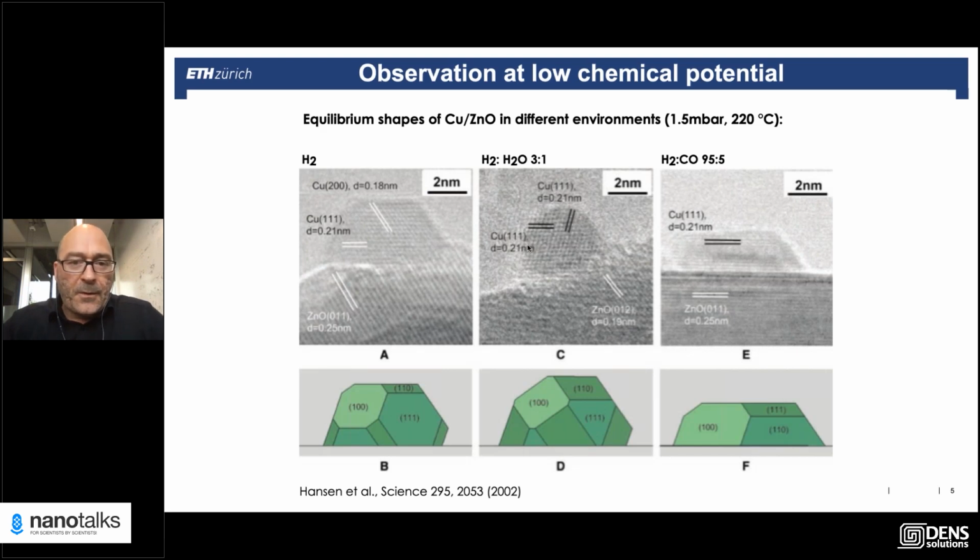And what you see is that different facets are exposed depending on the gas phase. So basically the particle, or the system, tried to find a low energy equilibrium state that is of benefit for the system. And we learn a lot from that, but one difficulty here is that these are really equilibrium states, but the catalytic reaction is never running close to an equilibrium. It's a far-from-equilibrium reaction.